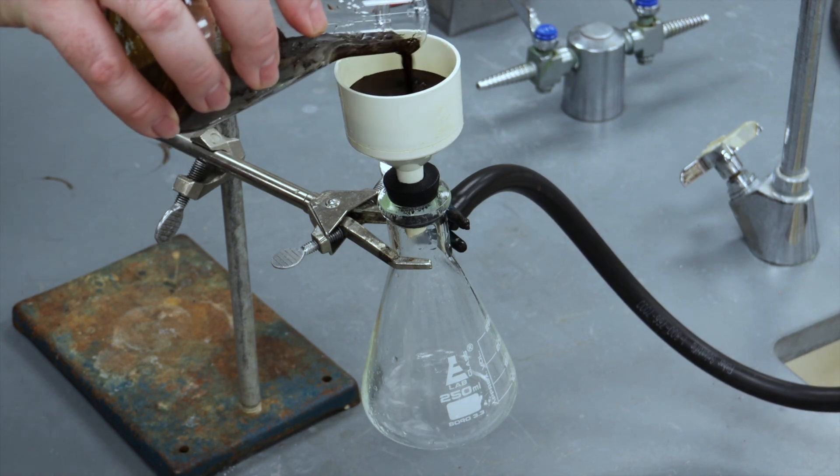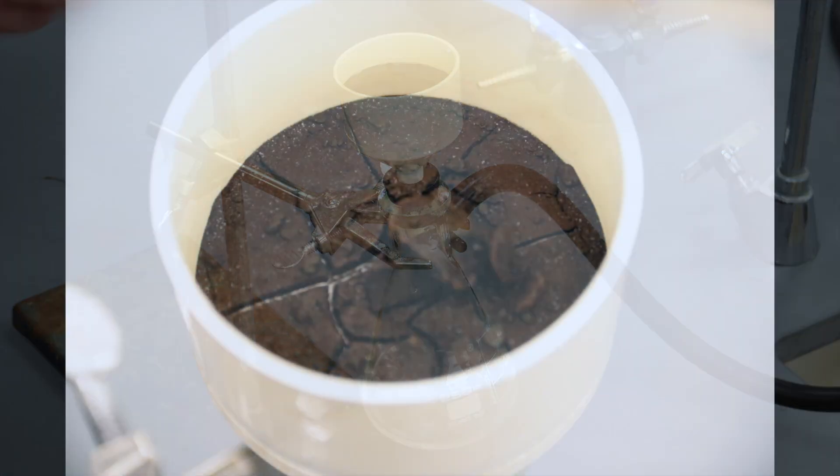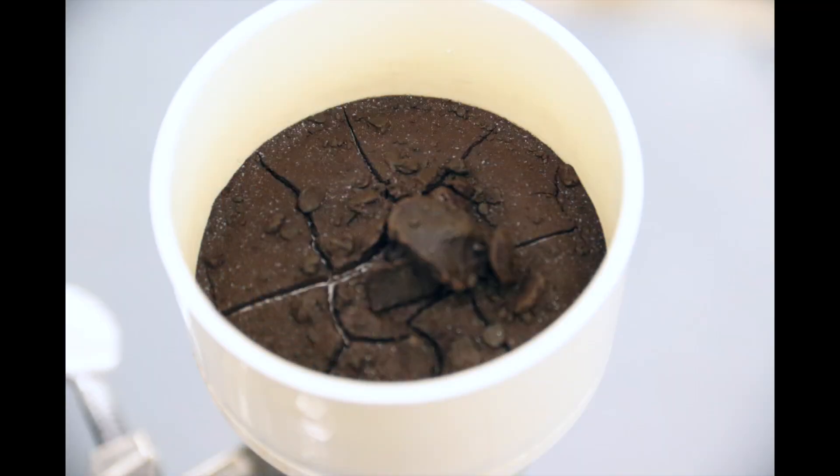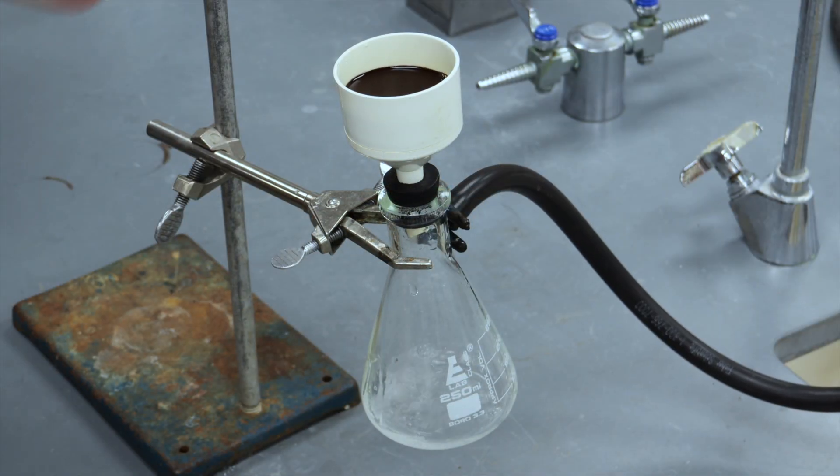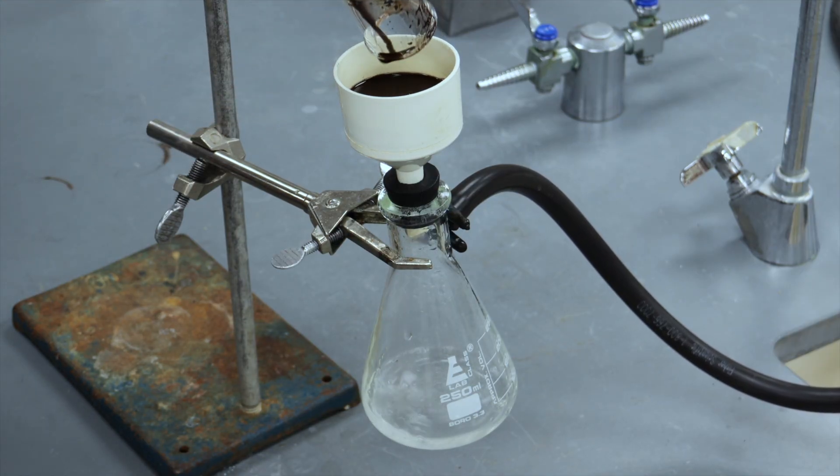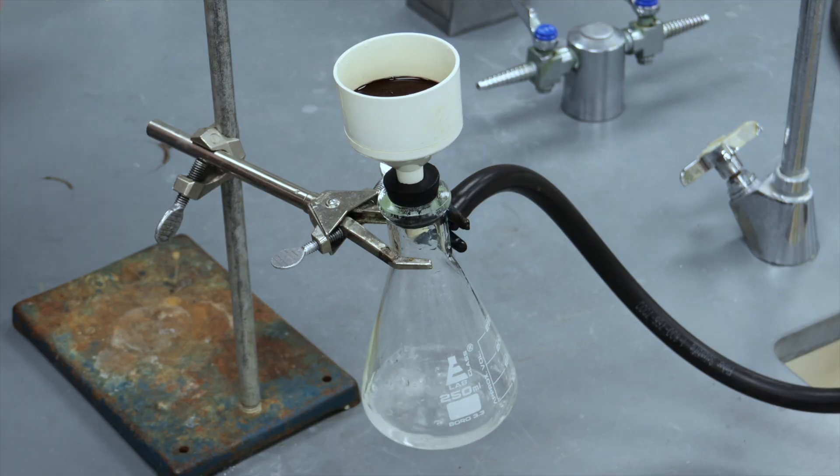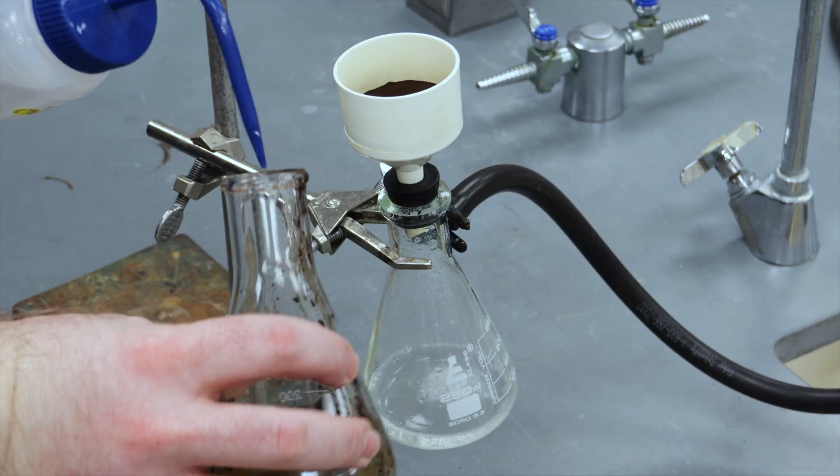Carefully pour your mixture through the Buechner funnel with filter aid in it. Pour slowly so that you don't damage the surface of your filter aid. Your filtrate should be clear, and in this case, colorless. You can wash the reaction mixture with more of your solvent, but you don't need to get all of the solid particles out of the flask. Your product should be dissolved in the filtrate.